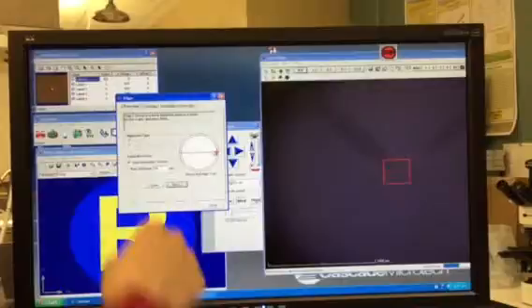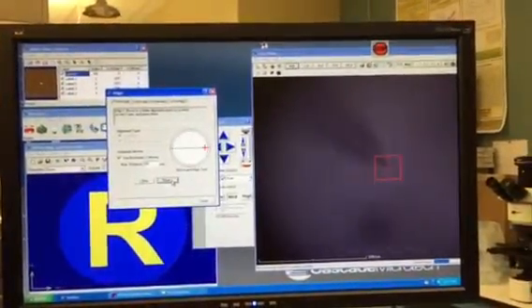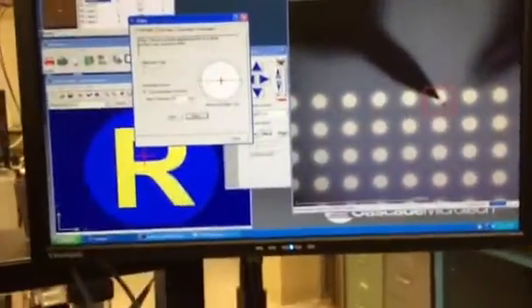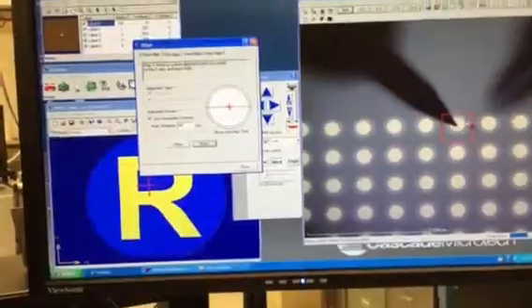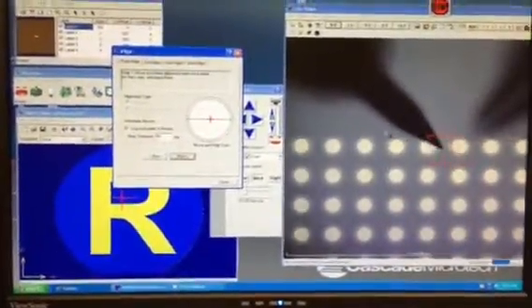And then you should return again. I don't like that. Is that dragging? Just a second, I don't want to damage myself. No, it's not dragging, it's just wiggling. It shouldn't be in contact. I was just nervous. Okay, good.